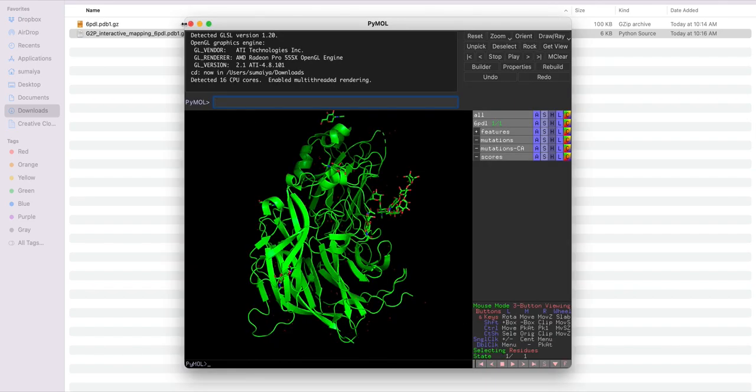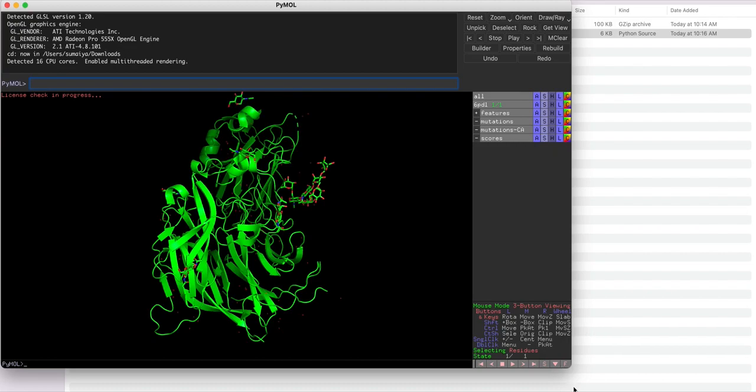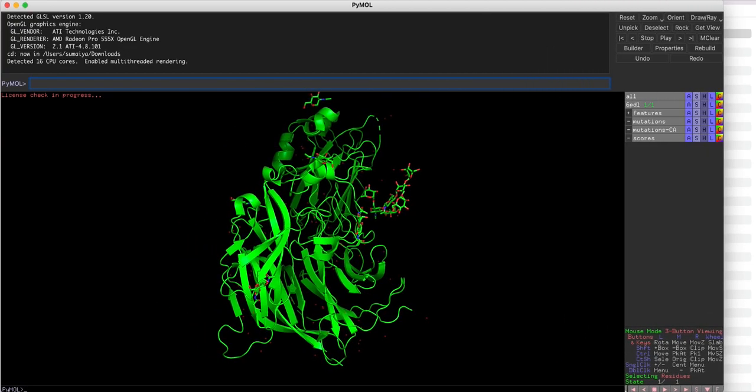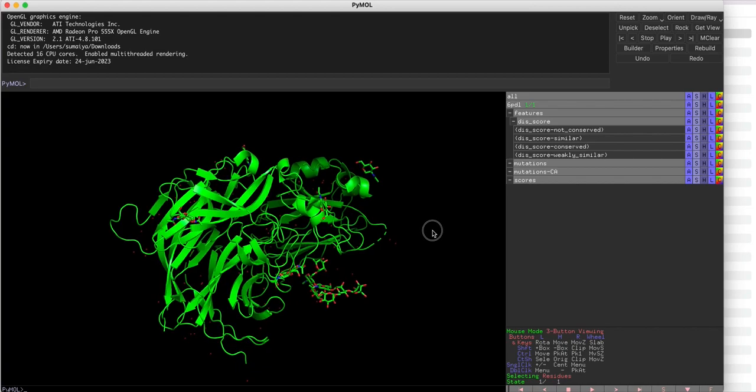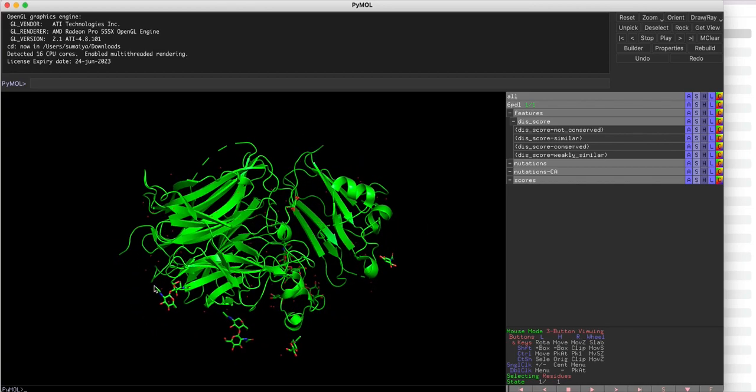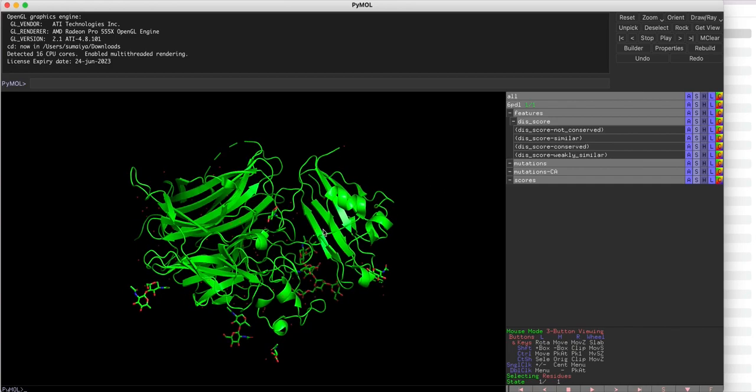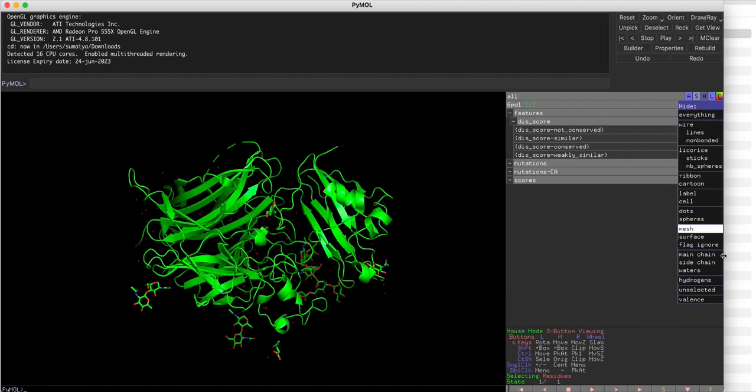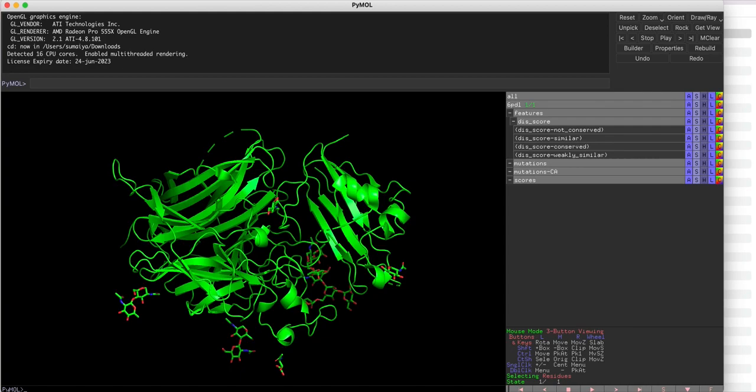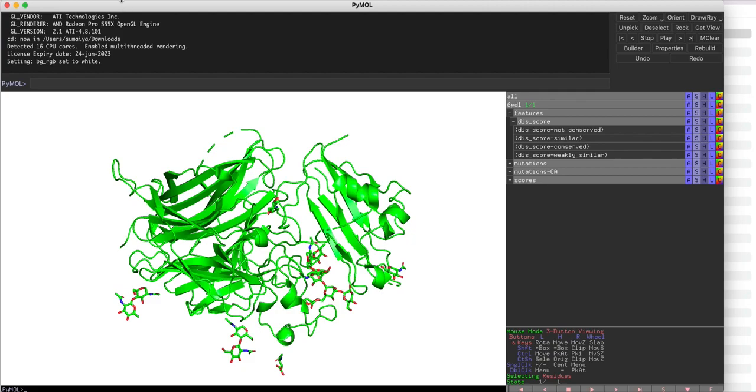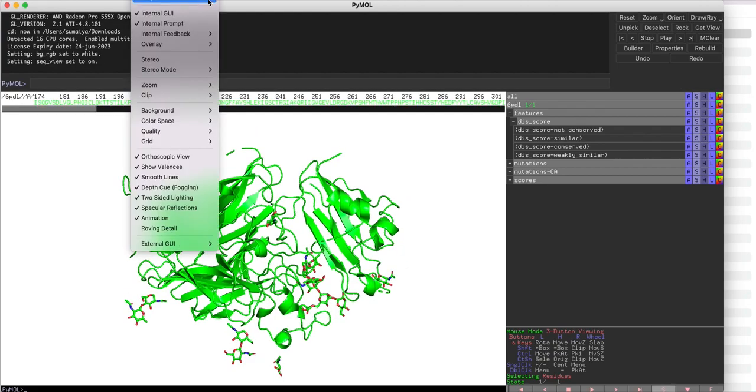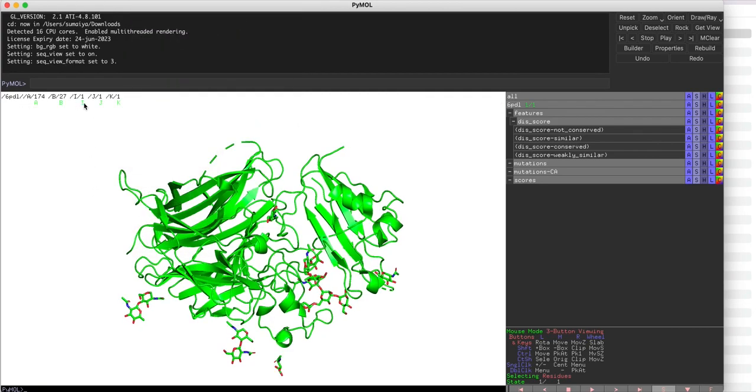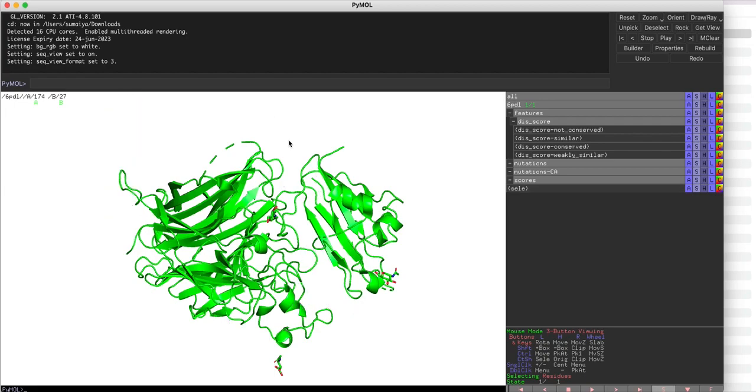Here is the annotated structure and the annotations that I mapped using the portal have been saved here as different selections. Now for visualization purposes I will do some cleanups. I will hide all the waters from the structure, display the background as white, and display the sequence as chain identifiers so that I can easily remove these ligand-like molecules. Now my structure looks cleaner.